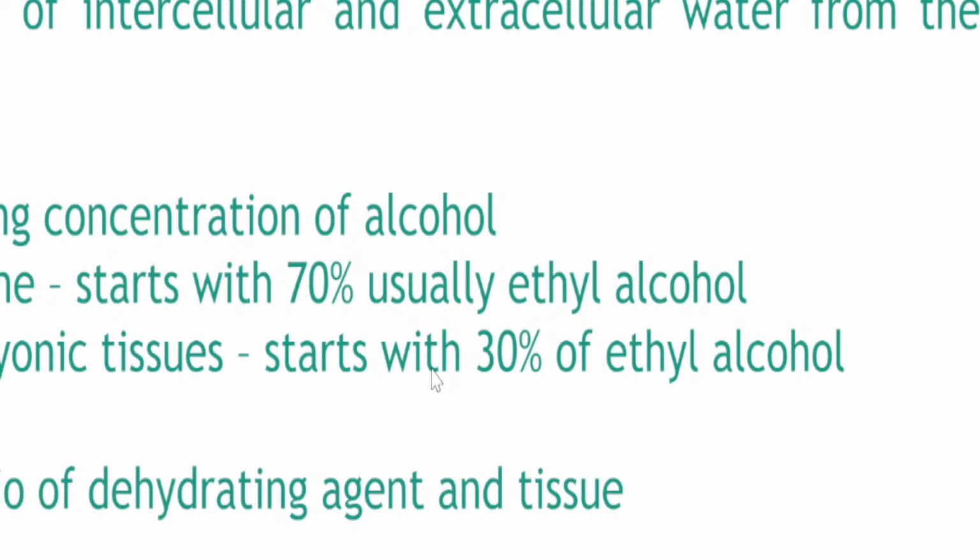Very good. Okay, so if water remains after fixation, we need to dehydrate the sample, right? So in order for us to dehydrate it, we can use increasing concentrations of alcohol. So routinely, we start at 70%.